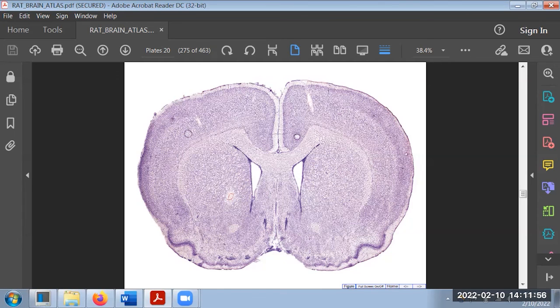We can also see that to the bottom left and bottom right, there are some parts of the rat brain's cortex that are especially dense and have absorbed a lot of stain. And so those are just very compacted gray matter. We also have these weird fang shapes. These are actually cross sections of the fluid-filled pockets this far forward in the brain, lateral ventricles, that we'll see in the sheep brain lab again.